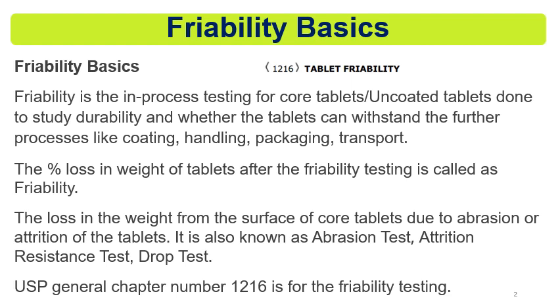See, friability is the in-process testing for core tablets or uncoated tablets, and it is done to evaluate the durability of the tablets and whether the tablet can withstand further processing like coating, handling, packaging and transport or not.